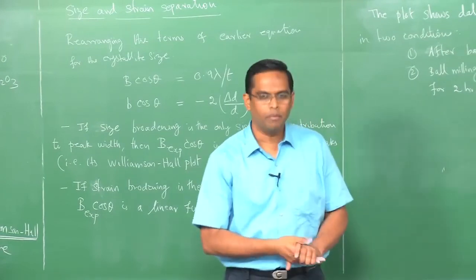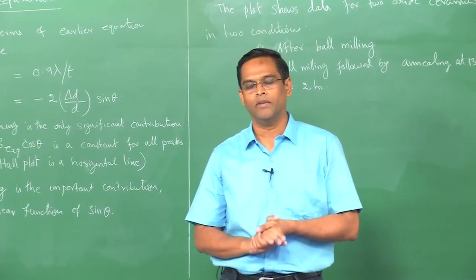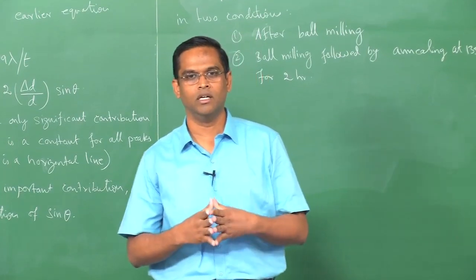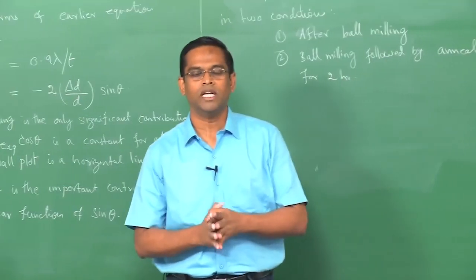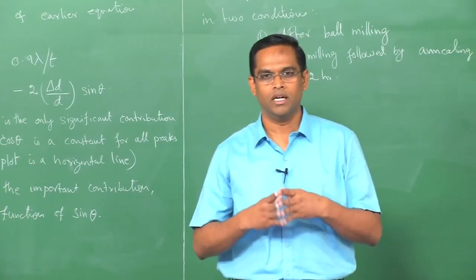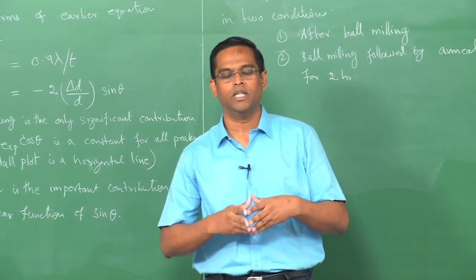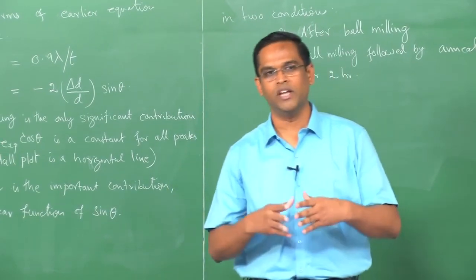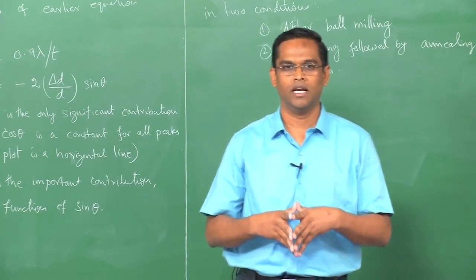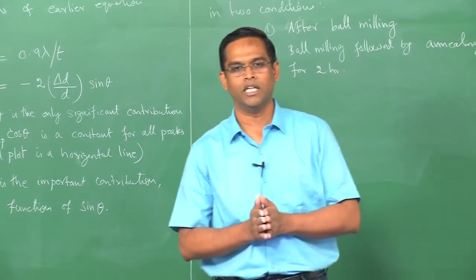So, this is one typical example of application of X-ray diffraction, where we have demonstrated how the size effect as well as the strain effect can be measured. And then other typical applications of X-ray diffraction are crystal structure determination, which everybody commonly uses this technique for, and also phase identification. Suppose you have a mixture of 2 or 3 phases in a substance, how to identify each phase, that is again a primary application of this technique.